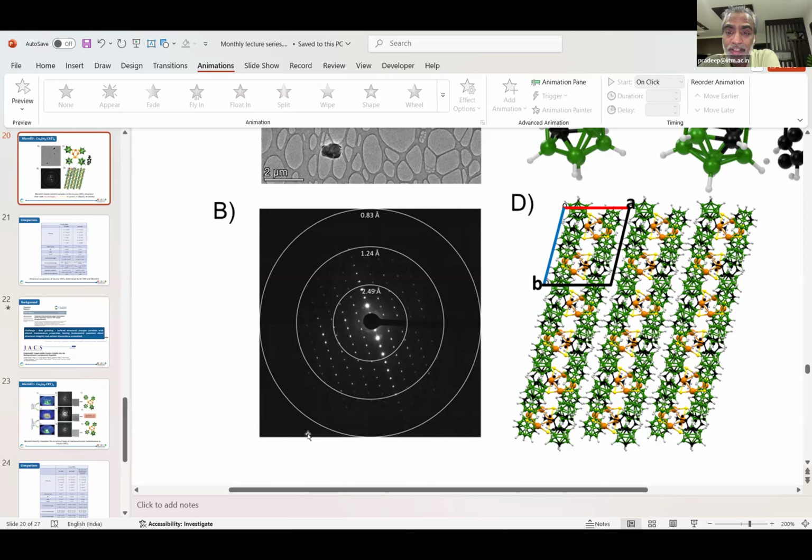It's the same thing as diffraction resolution in any diffraction experiment. How closely can you see? You can measure that from your TEM images. Similarly, if closely spaced lattice lines can be resolved, that is the resolution of your spectrometer or microscope or whichever device you have. Based on those spots only you are creating the structure, so this is nothing but the resolution of the structure itself.